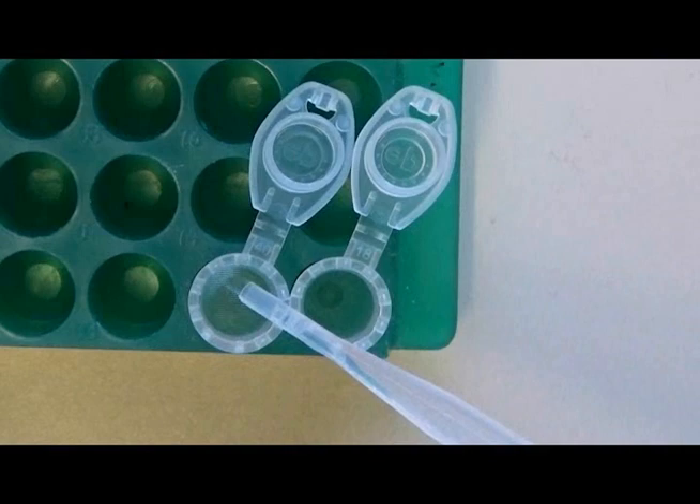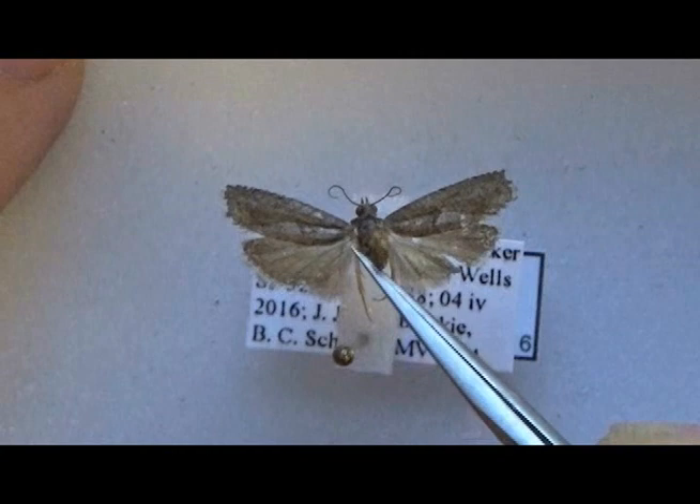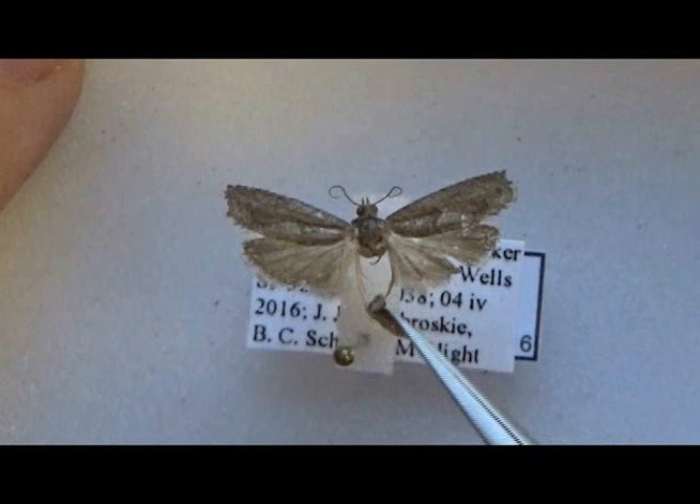KOH will act to digest most soft tissue away, leaving behind the genitalia, abdominal wall, and other sclerotized or membranous structures. The next thing I do is carefully remove the abdomens from my selected moths. Using a fine pair of forceps, I will gently push up on the underside of the abdomen — it should pop right off.